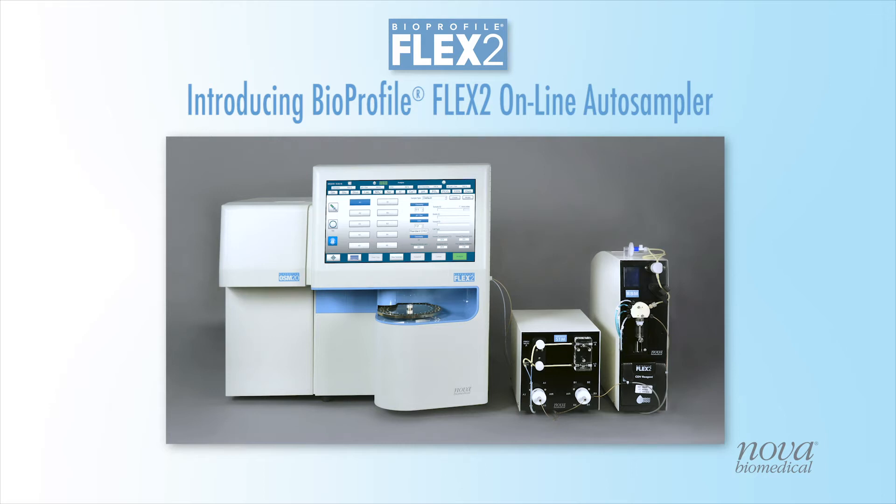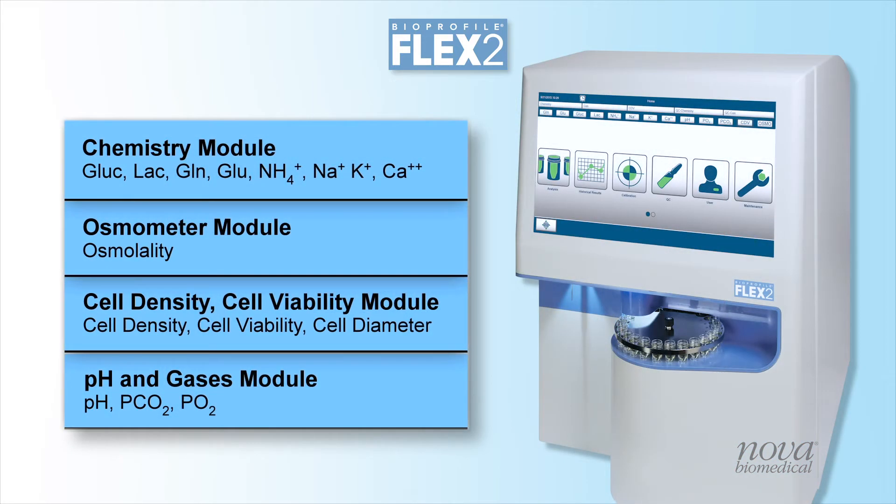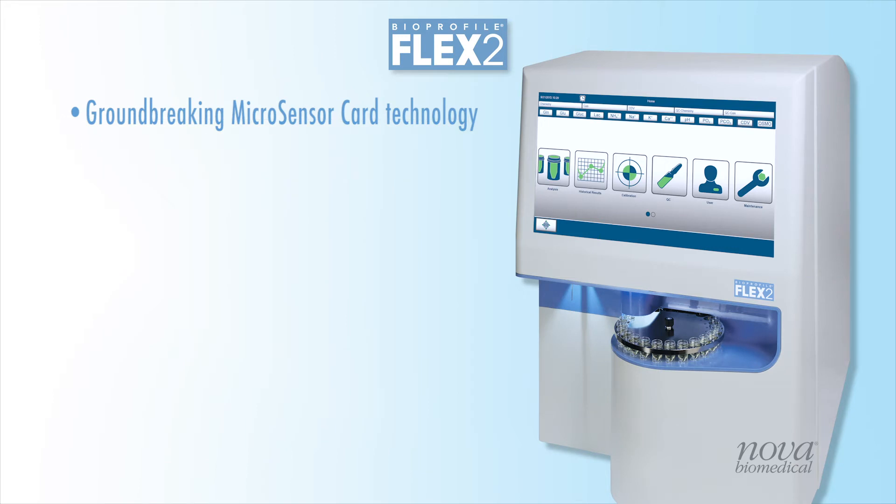Introducing the Bioprofile Flex2 Online Auto Sampler from NOVA Biomedical. Flex2 is a modular platform measuring up to 16 cell culture tests including nutrients and metabolites, osmolality, cell density, cell viability, cell diameter, pH, and gases. Bioprofile Flex2 utilizes NOVA's groundbreaking microsensor card technology to reduce sample volume requirements and analysis time.